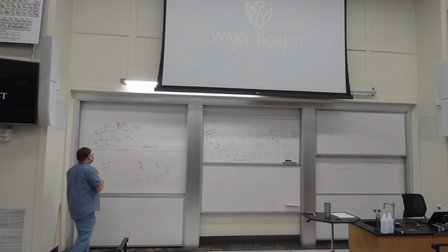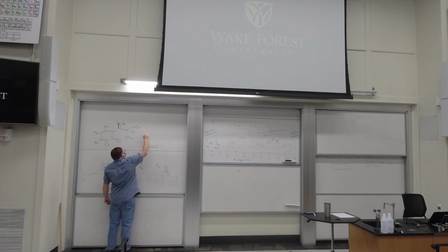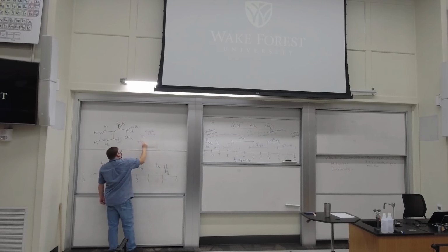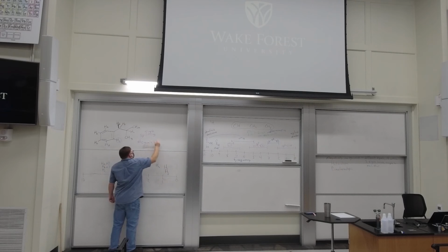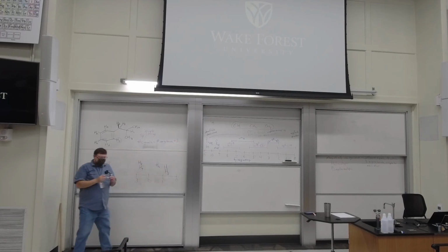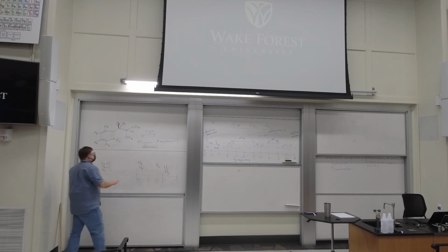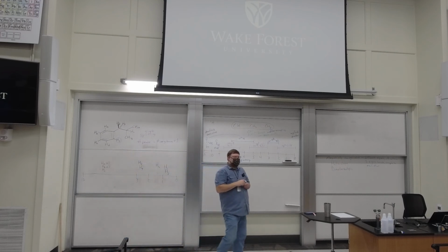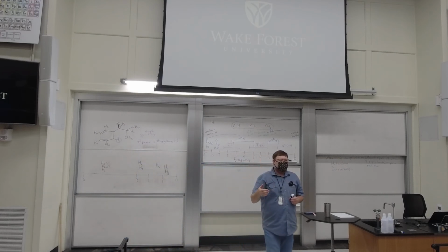The rule comes down to simple splitting. I know everybody always rolls their eyes at me. The number of peaks in a signal is equal to the number of neighbors plus 1.